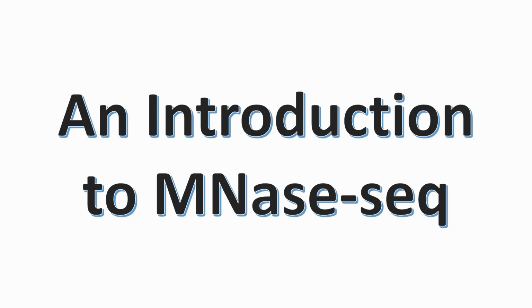Hi everyone. This is an introduction to MNase-seq. MNase-seq, which stands for micrococcal nuclease digestion with deep sequencing, is a method to identify open chromatin in DNA. To begin with, we must first understand some basics about chromatin structure.